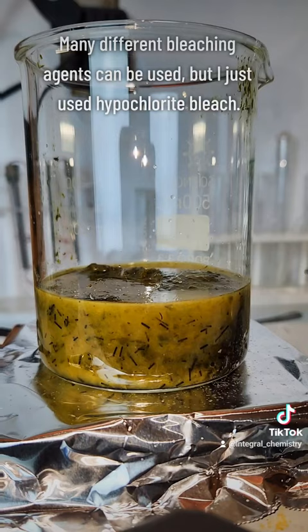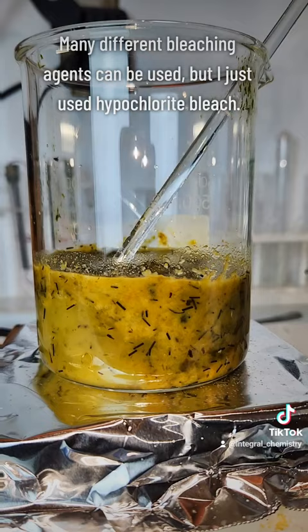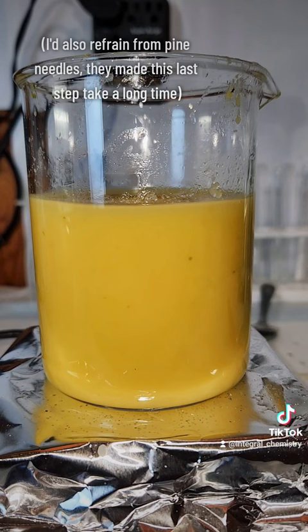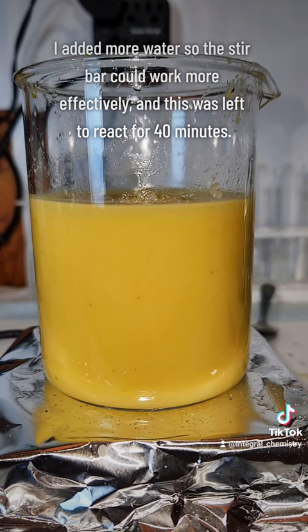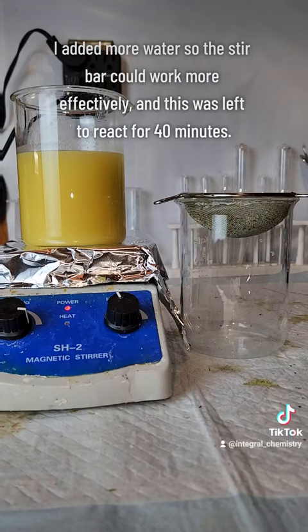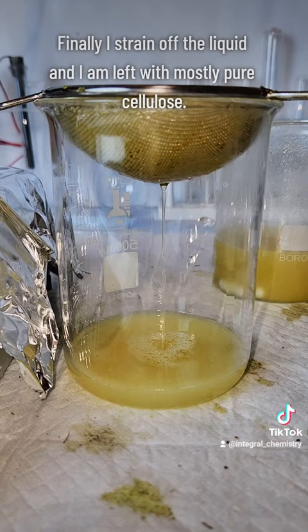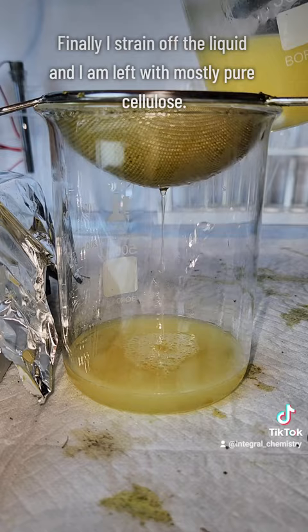Many different bleaching agents can be used here, and even though it's not standard in industry, I just use sodium hypochlorite, which is Clorox. This step typically only takes about 20 minutes, but I have some pine needles in here that didn't really fully break down, so I let this go for about 45 minutes. I also added more water to allow my stir bar to actually be able to mix this thoroughly. After about 30 to 40 minutes, I dump this through my filter again, and I'm left with mostly pure cellulose. This cellulose is rinsed several times with distilled water to remove as much of the bleach as possible, and this is what I'm left with.